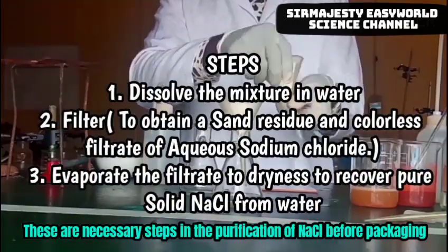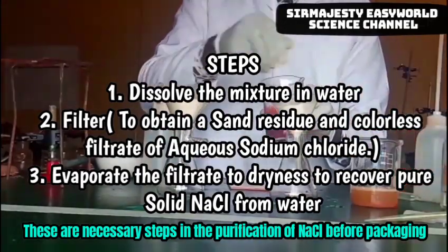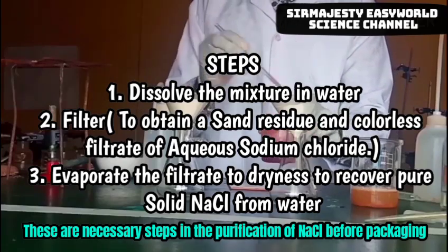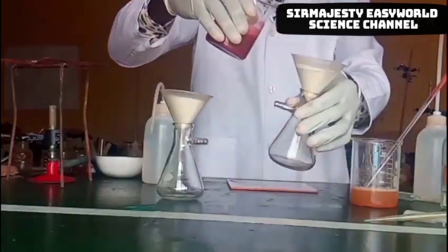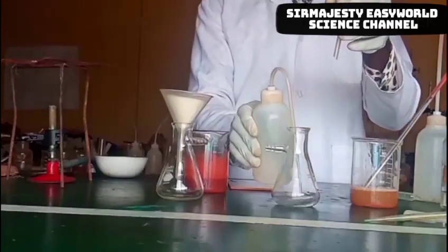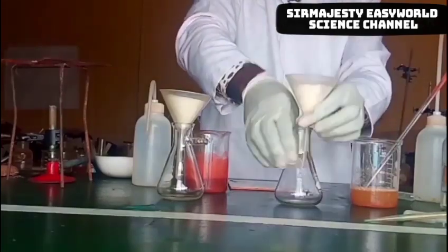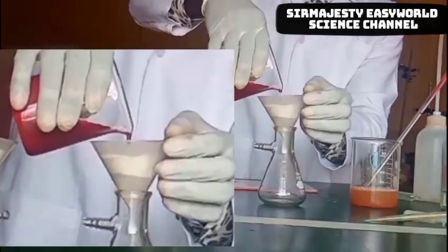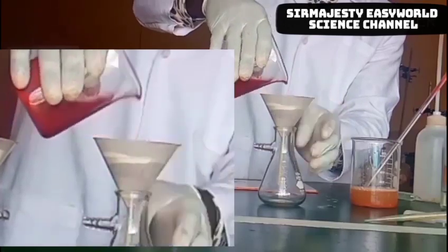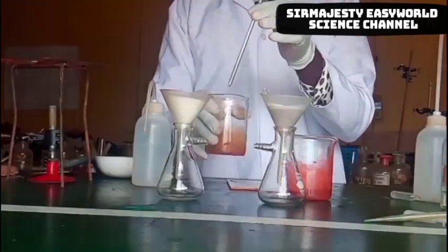The separation technique involves: first, dissolution in water, followed by filtration, then after filtration, evaporation to dryness. You dissolve the mixture in water, then subject it to filtration, after which you have the filtrate and the residue. Wash carefully if you want to collect a pure sample of sodium chloride, in case you suspect any dirt or contamination. Now we are pouring the clay soil and sodium chloride mixture.